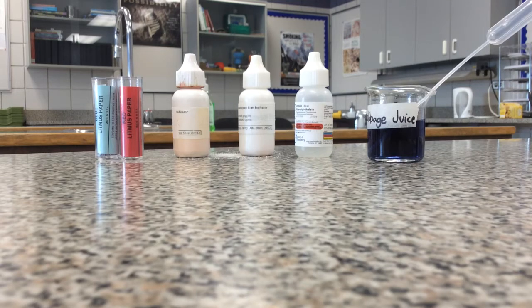Everybody. If you're watching this video, that probably means you have looked over the acids and bases notes, or you were here, and now you're ready to start testing some of them. It's really important that we know the difference between acids and bases, right?